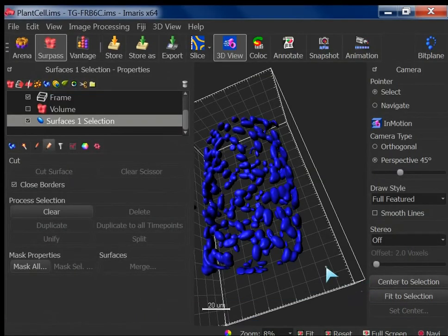Okay, and after that I have created this surface on that channel just to aid the segmentation, right? Now, if I want to quantify what is there inside, I cannot use that channel because that channel has already been smoothed. Understand? Yeah. I have used that procedure just to create a nice segmentation.